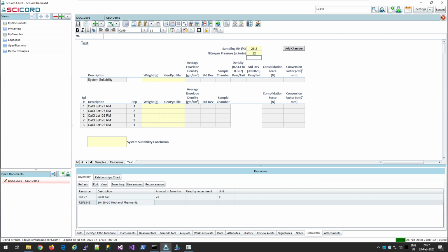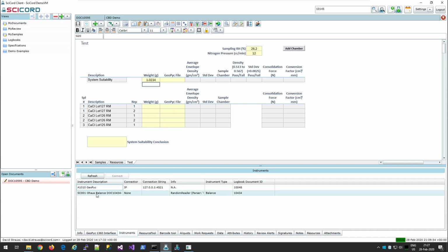We begin the testing process by recording weights for each measurement in the gold cells provided. Limits may be defined for any type of data entry and excursions flagged or prevented. Weights may be recorded manually. However, for compliant labs, this might entail retaining and attaching a printed balance report. When recording a set of sample weights or other real-time measurements like pH, automation is both more efficient and compliant.